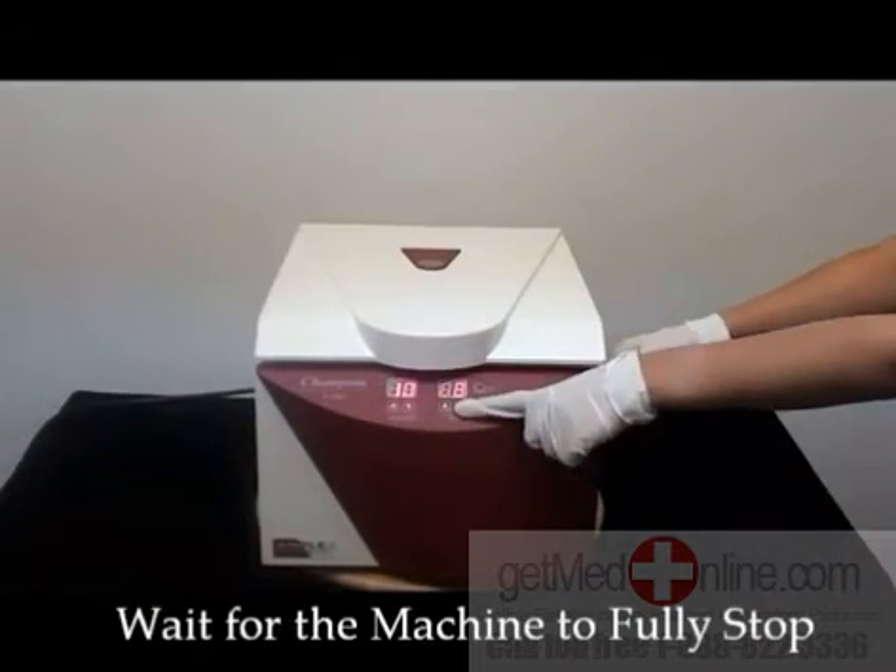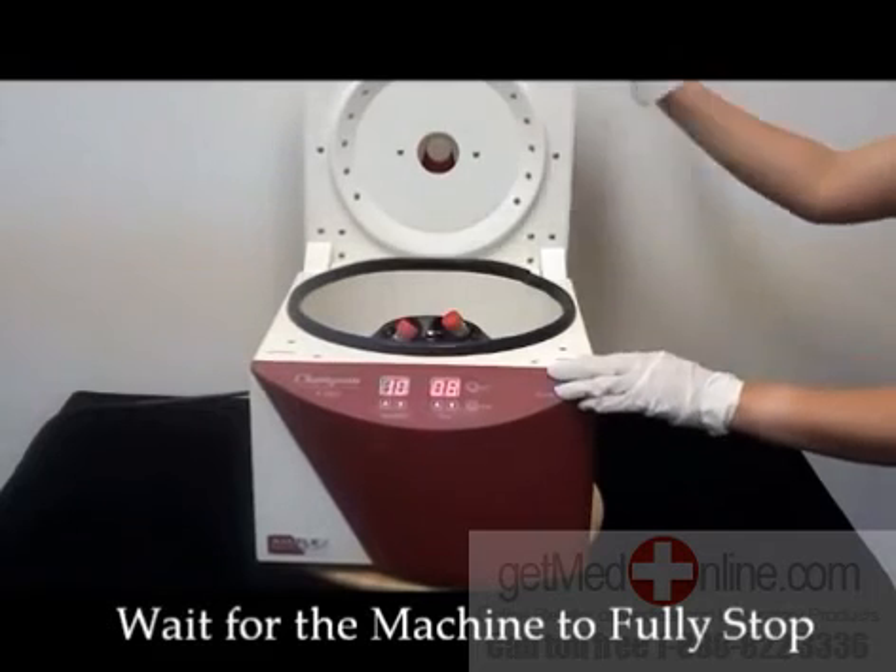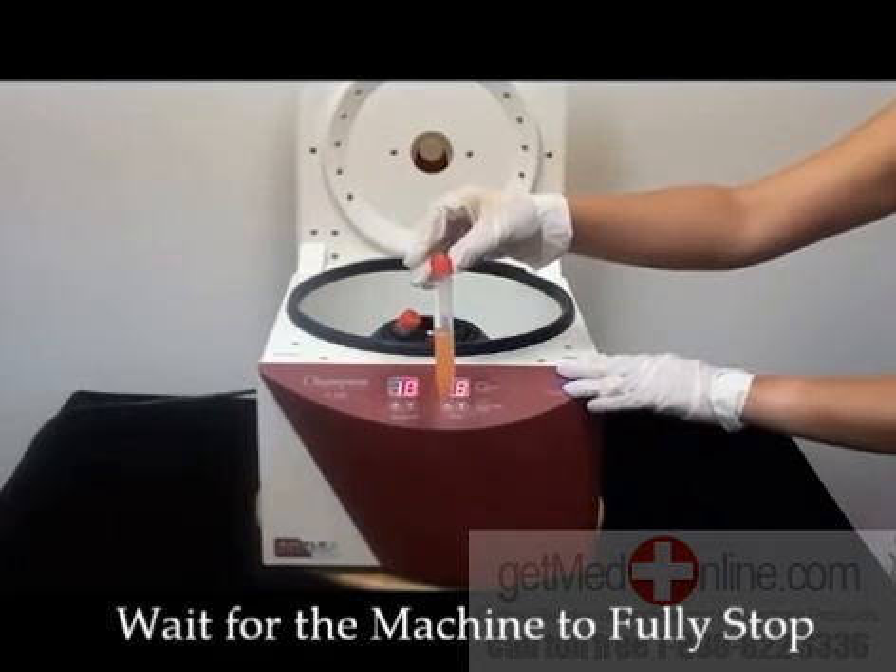When the sample is done and the timer has gone off, unlock the lid and wait for the machine to come to a full stop. You can then take out your samples.